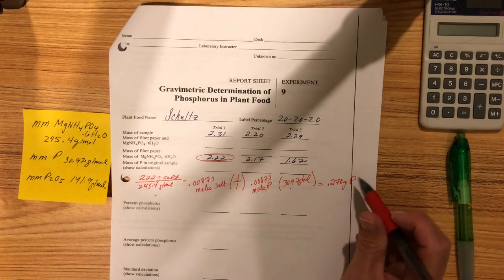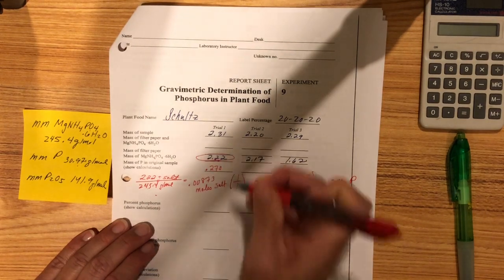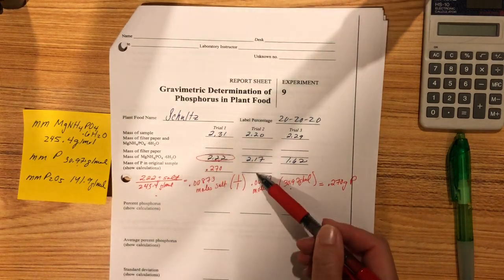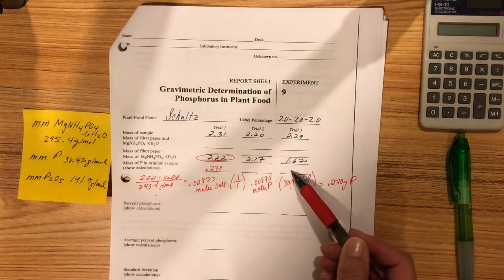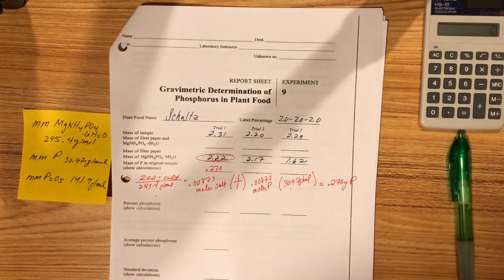Now, okay, so this is our mass. I'm going to put this right up here, 0.270 grams of phosphorus. And you're going to go ahead and do that exact same process for your other 2, and you're going to get your mass of phosphorus in each one of those. So you can go ahead and pause it now and get that done, so then you have some stuff to work with.